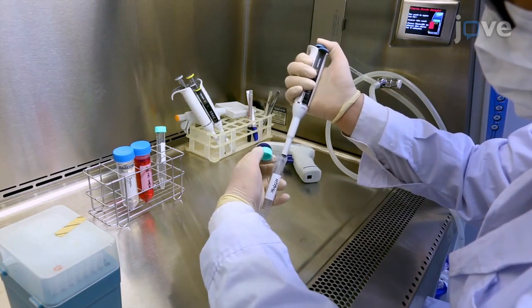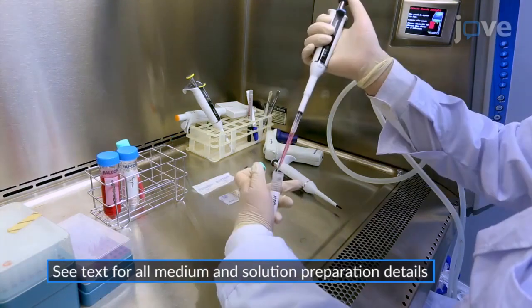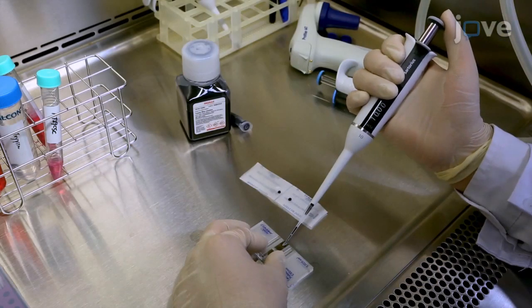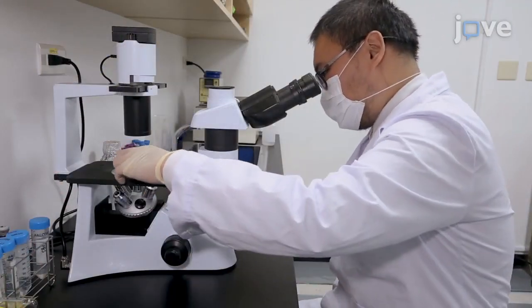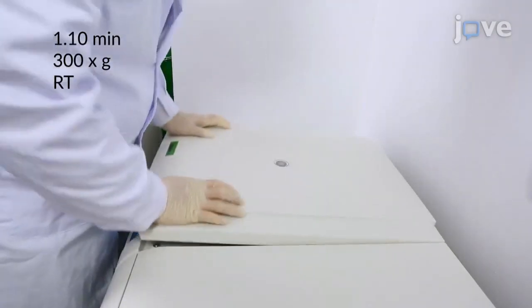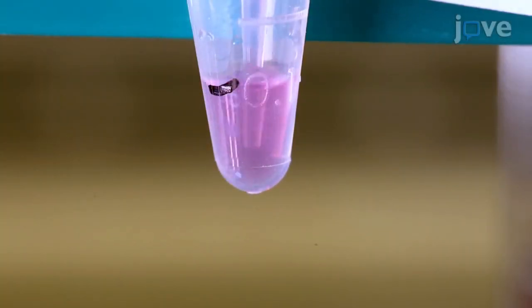After 5 minutes at 37 degrees Celsius, neutralize the trypsin with 2 times the volume of growth medium and count the cells using a hemocytometer. Collect the cells by centrifugation and resuspend the pellet at a 5 times 10 to the 4th cells per 100 microliters of medium concentration.